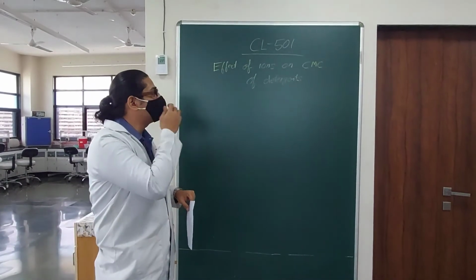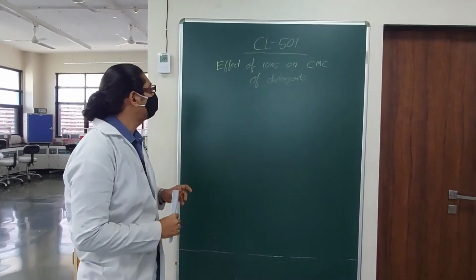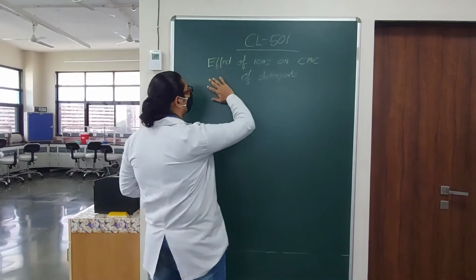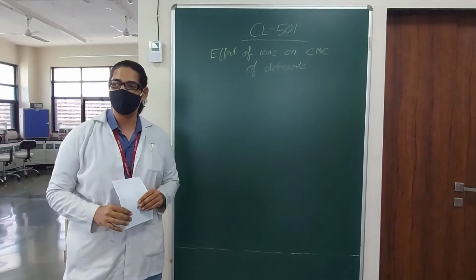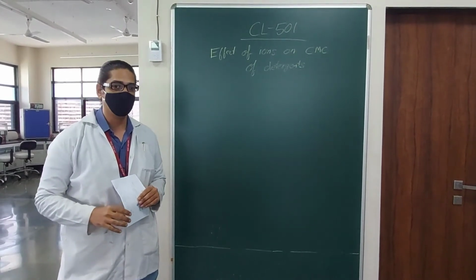Right. Welcome again for yet another experiment. What we are going to do today is to see the effect of ions on the CMC of the detergent.